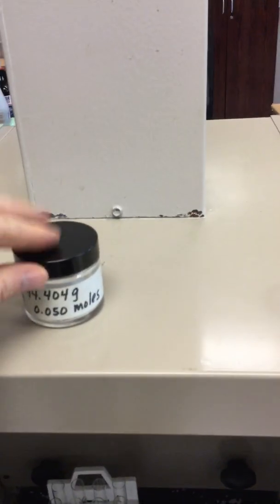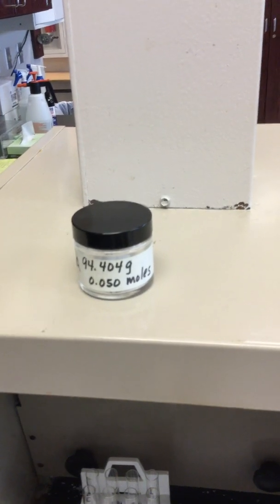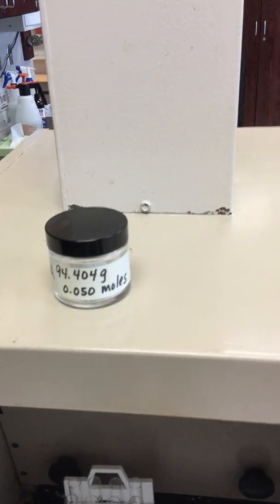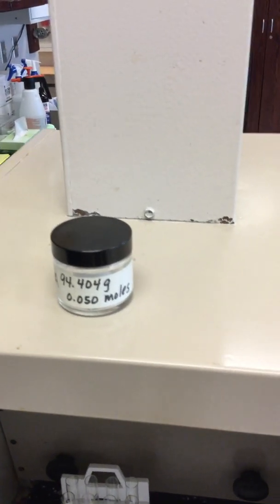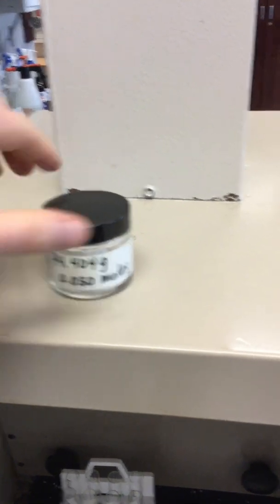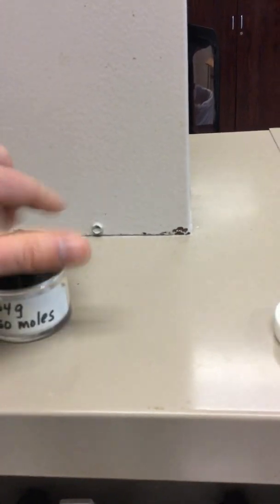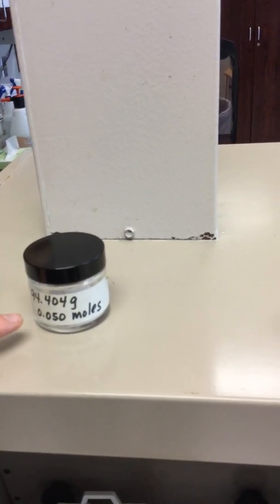And finally, station 12 is a little bit strange. Station 12 is this fun little jar, and this jar has some information written on it. It tells you the mass of the jar when it's empty. That jar when it's empty weighed 94.404 grams. Then I took the empty jar and filled it up with a substance. You can see the substance in there. I put in exactly 0.050 moles of whatever substance that is.